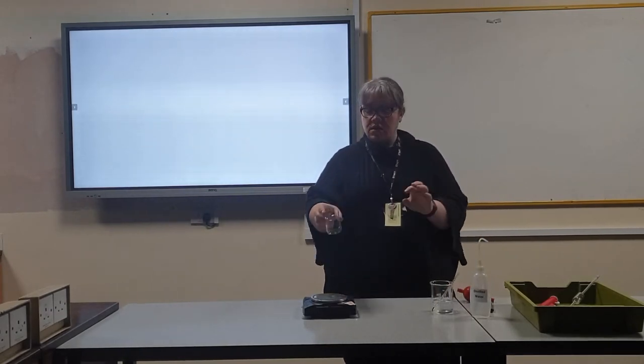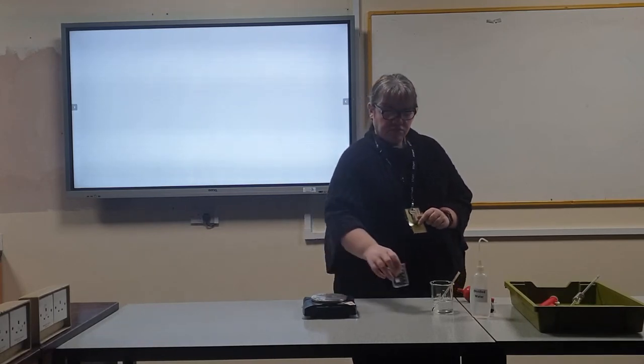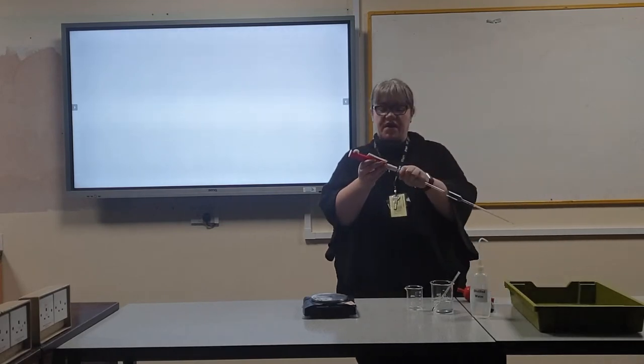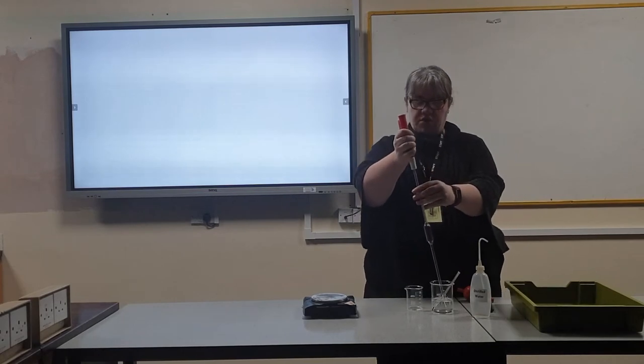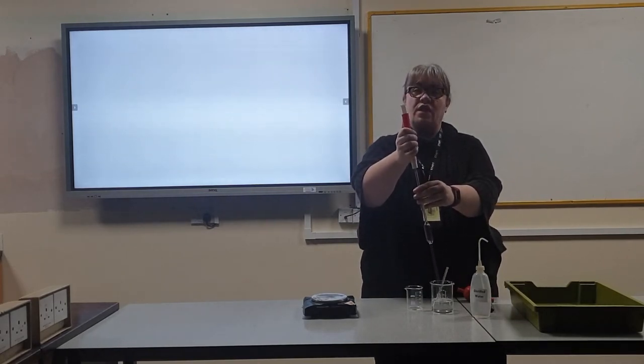Take the smaller beaker and record the mass. Place the pipette filler on the end of the pipette and draw up water until the meniscus sits on the line.